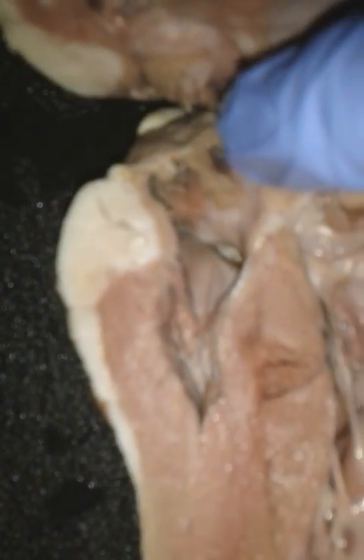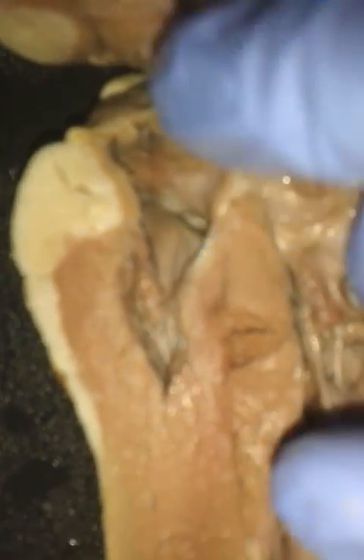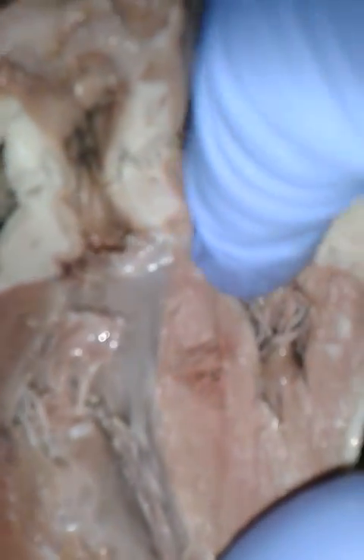Okay, and then as we go over to the right side, we have, let's see, our valve's a little higher. Actually, the valve was cut, so I'm going to turn it a little bit. But on the right side, we have the valve right here.